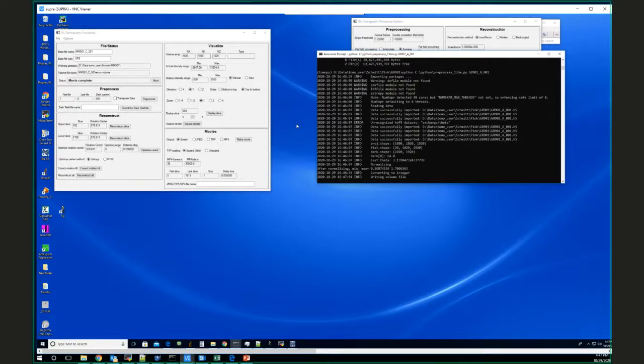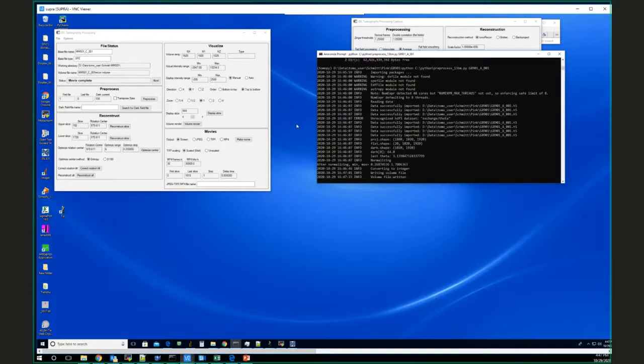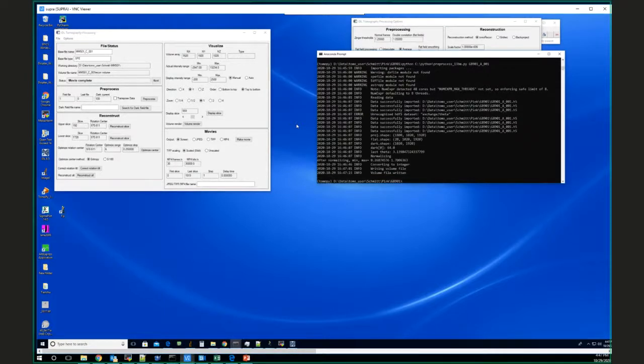that's a whole day in itself, because you have to do what's called segmenting the data, assigning a voxel to be one of multiple phases. Sometimes that's pretty easy. If you only have two phases and they're very different in their linear X-ray absorption coefficient, you can use a simple threshold that says anything brighter than 0.1 is phase A and anything less than 0.1 is phase B.